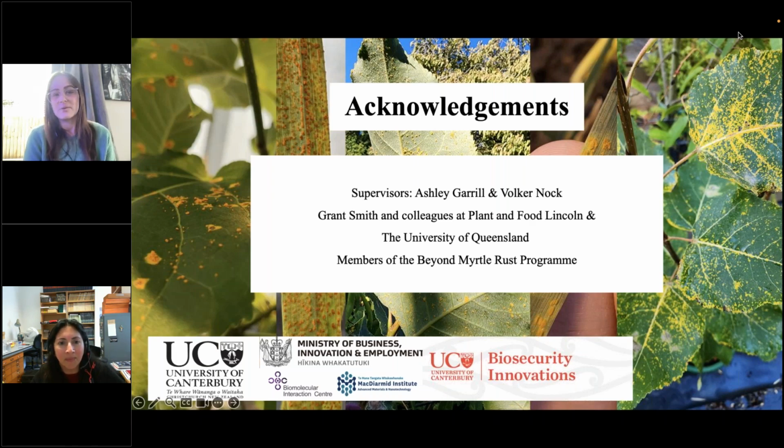It would be good to be able to put pillars in a range of spaces, but they're going to need to produce at least a 100 micron germ tube. But they do that quite easily anyway, so it shouldn't be an issue as long as they grow in the right direction and in the right place. Like, go this way. No, the other way.